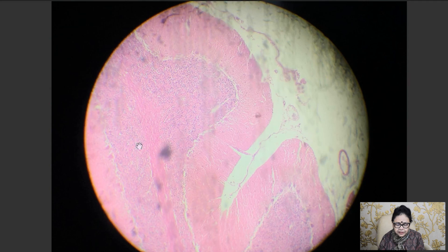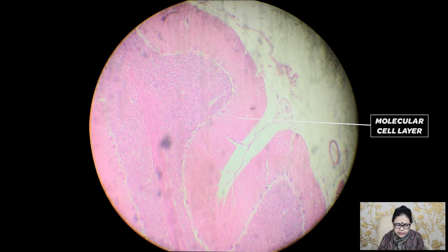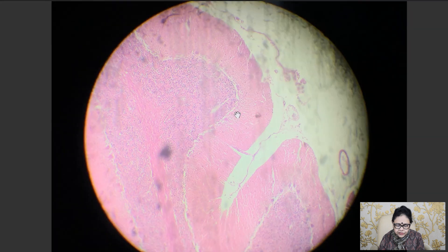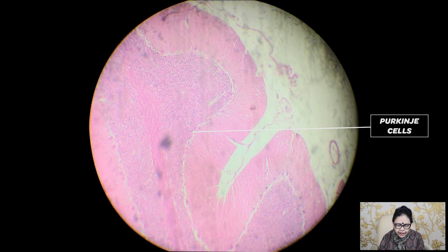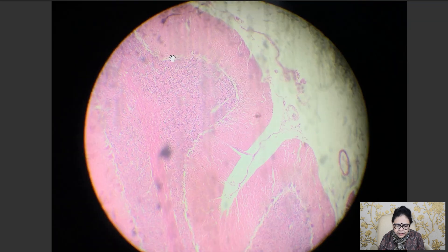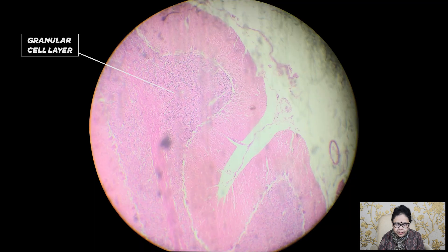This is the field of the microscope. You will see the circular field, and here you will see this pink color area - the molecular cell layer, light stained. Next you will see a gap where a single layer of cells is present. That is the Purkinje cell layer.